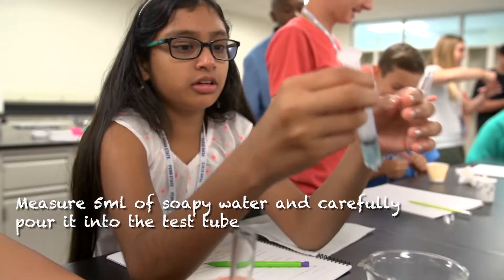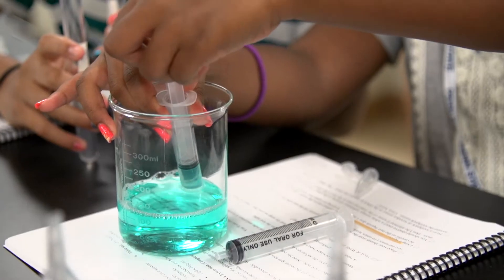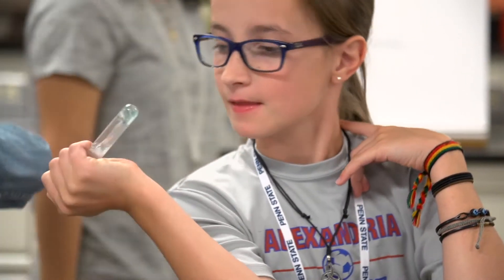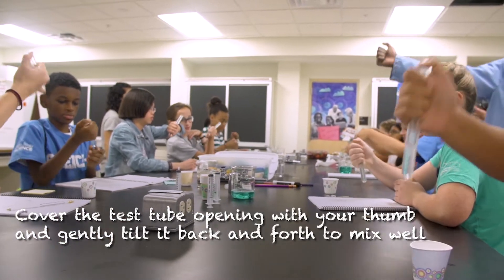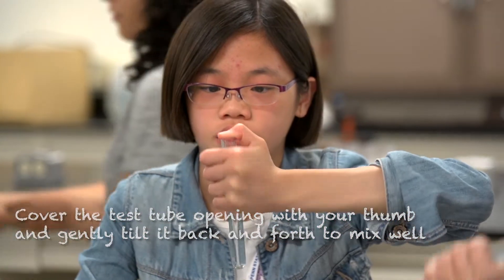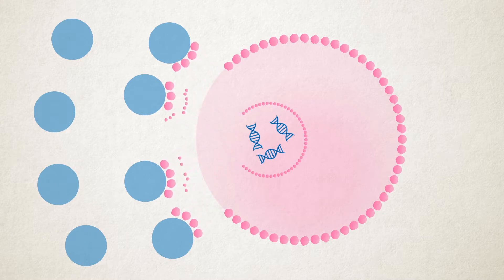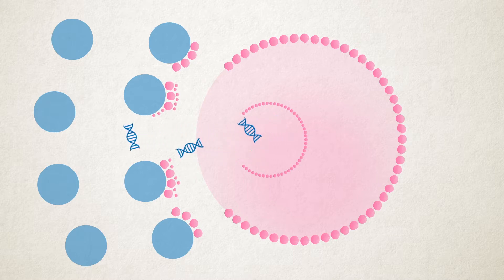We had to pour some soap in the test tubes. The soap makes it so the cheek cells come apart. The soap breaks open the cells and the cell nuclei by destroying their membranes, releasing the DNA into solution.